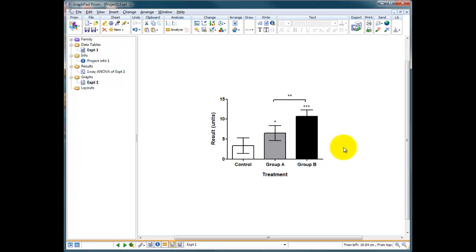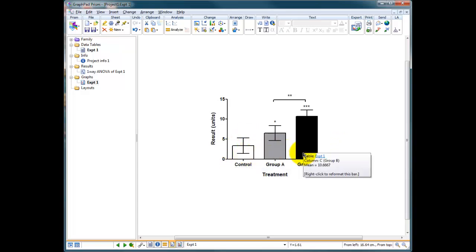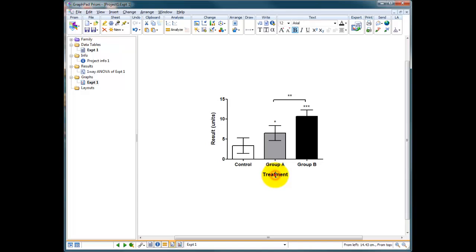Okay, so we've got our graph here. We've just done our ANOVA analyses. Let's just relabel this graph now to reflect an experiment that might have taken place. These could be concentrations, for instance, of a treatment. This could be zero or control. This could be 50 micromolar and 100 micromolar. So I'm going to relabel this and call it a drug, and we're going to say it's in micromolar.